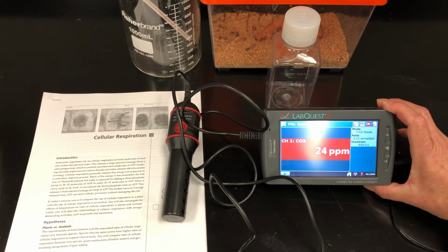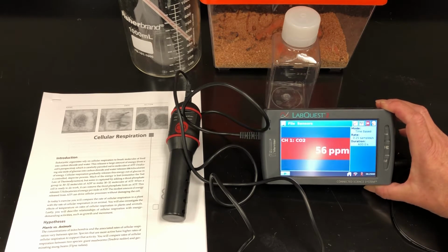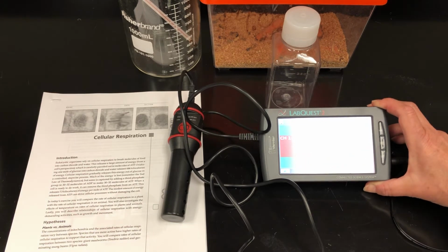But I'm going to be calibrating the sensor outside where you have regular ambient CO2 levels. I'll insert it into the container and then start the lab collecting the CO2 data here inside the lab after I've calibrated it outside. Then I'll bring it in, set everything up, and we're good to go.